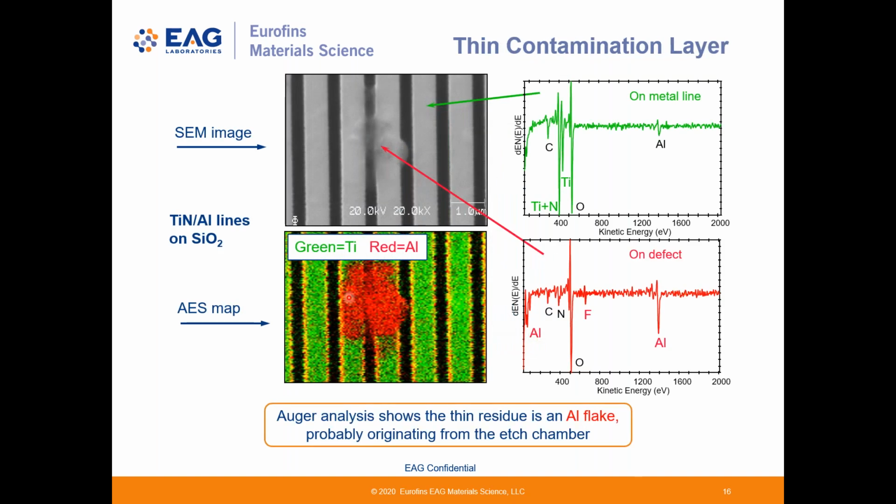So this first example can be summarized in one slide. With our electron beam and an integrated secondary electron detector, we can create SEM images much like an SEM. We use similar beam voltages as dedicated SEMs, but the beam diameter for Auger is at least an order of magnitude larger than the beams used in dedicated SEMs. We need higher current to generate Auger emission, and it's difficult to cram all those electrons in a very tiny beam, so there is some sacrifice to spatial resolution in Auger.